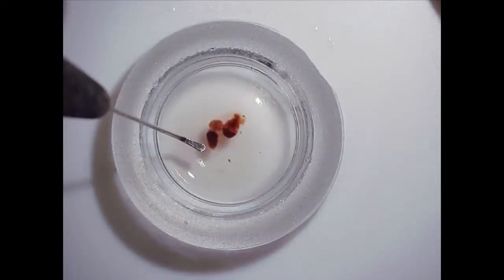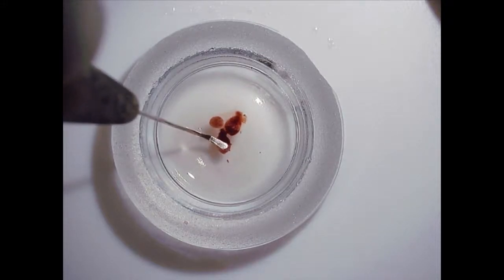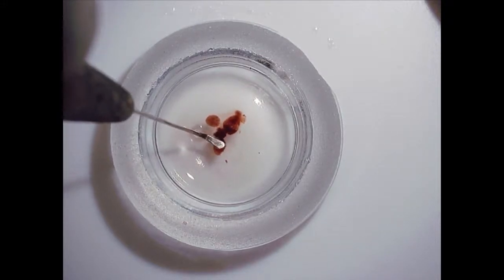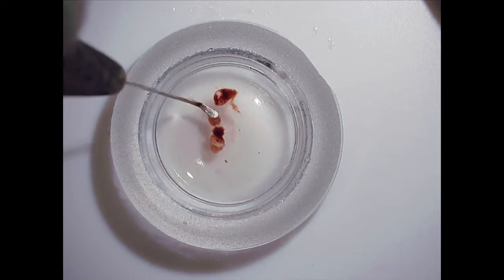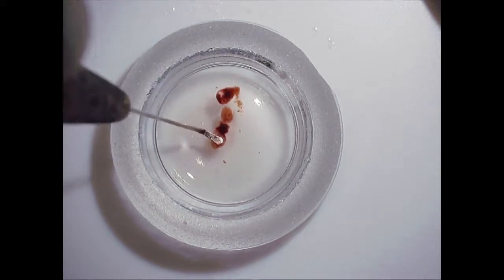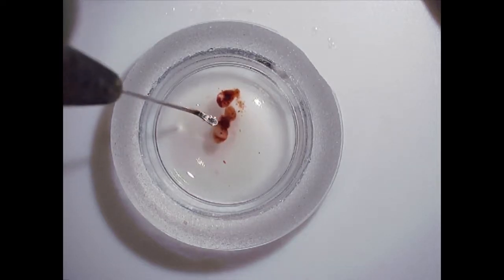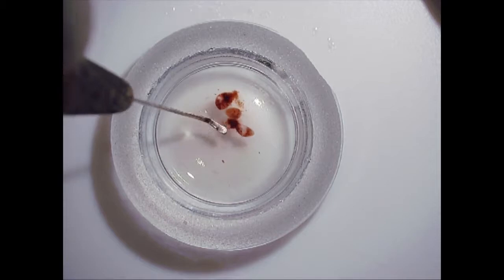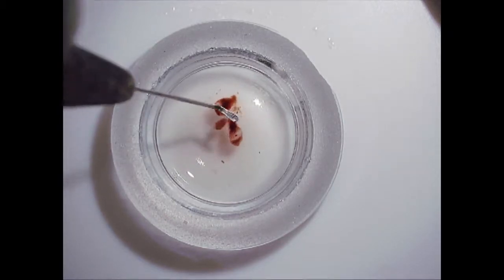Here I'm using a spatula. That's one of the micro tools that we have. And I'm gently pressing down on the scale body. You can see the gut contents, the fat body, is coming out of the integument. You want to gently use a pumping action here. And this may take a little bit of time.